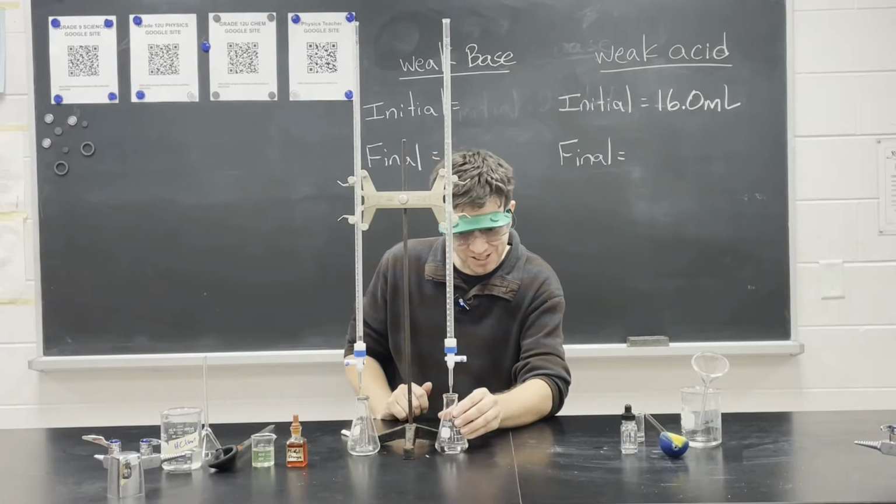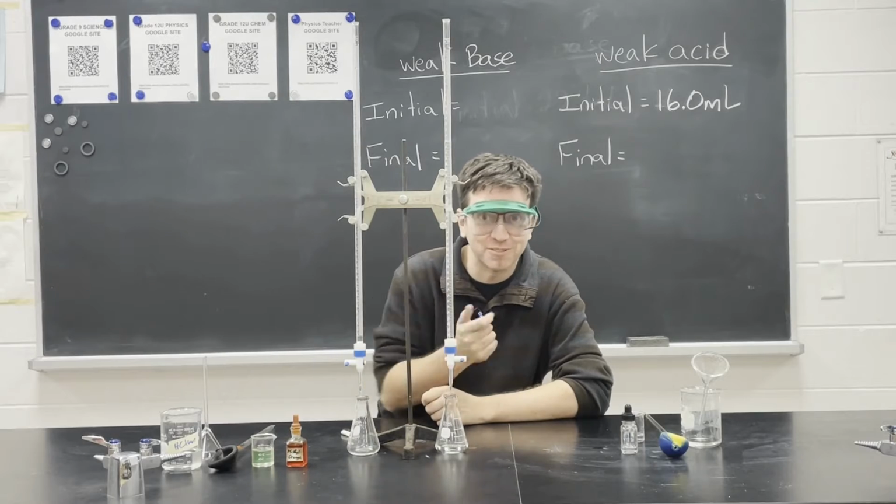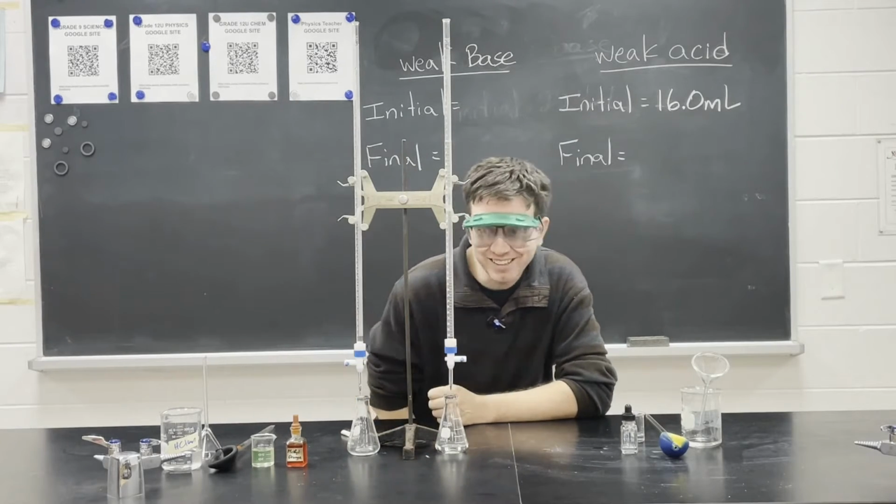Now if you've done a titration before, you know this is going to take a while. So from this point, I will speed up the video for you. Let's get started.